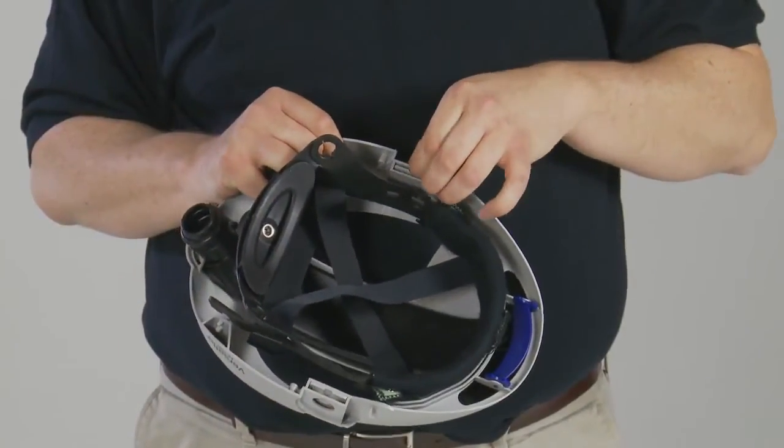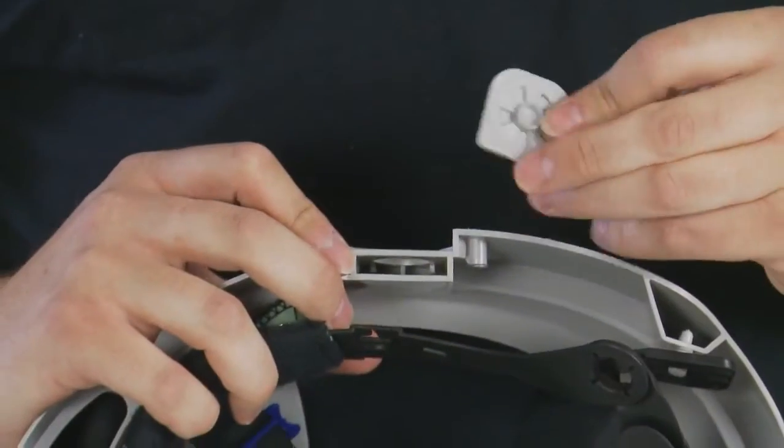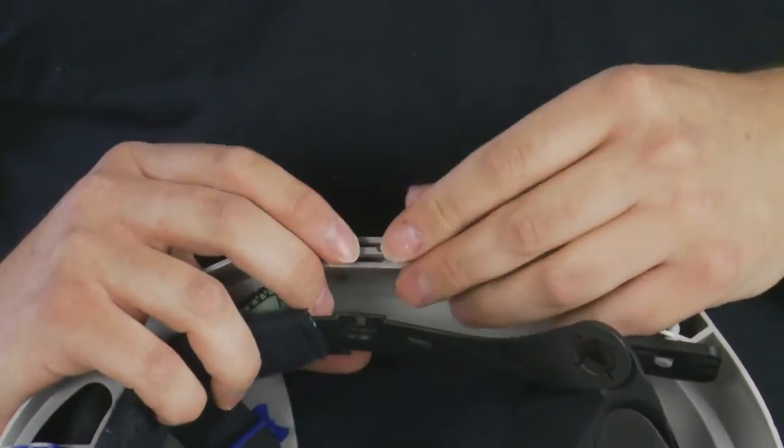To replace the cams, lift to release and slide out of the slot in the head top. The cams can be replaced by just sliding into position.